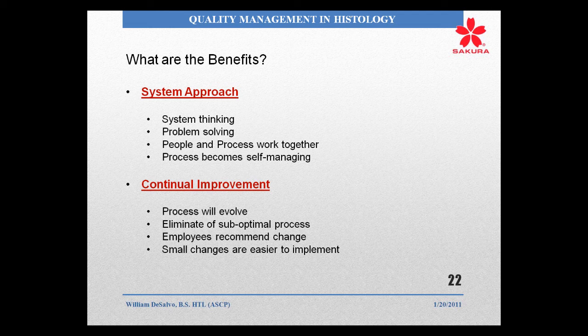Your employees begin to recommend change. And that's what you're really trying to do with your quality management system. If you've had a recent visit by CAP inspection, they're no longer spending a lot of time coming in and reading your manuals. Yes, they review your manuals, but they want to come into your laboratory. They want to talk to the people on the bench and say, what do you do? How do you do it? What happens when you have a problem? It's great that you have it in an SOP, but if you don't have the involvement of your people, you really don't have a good quality lab.